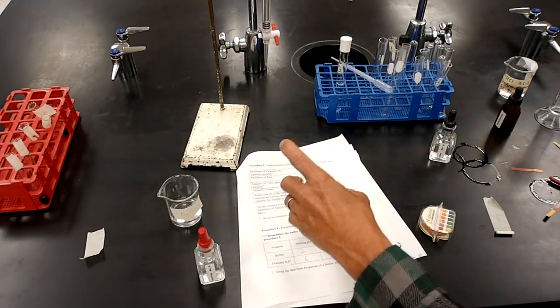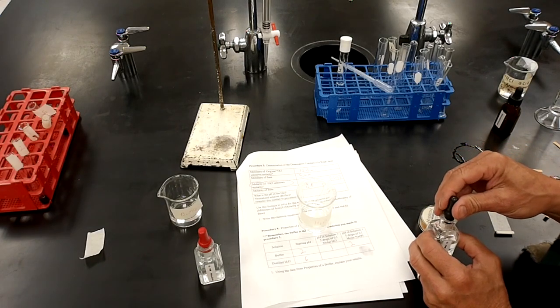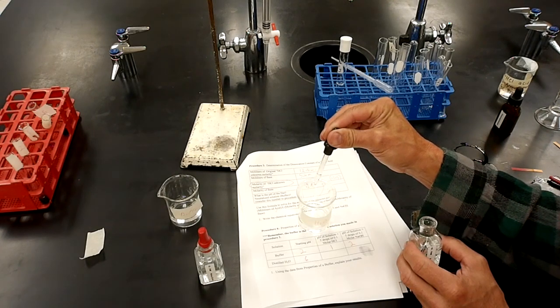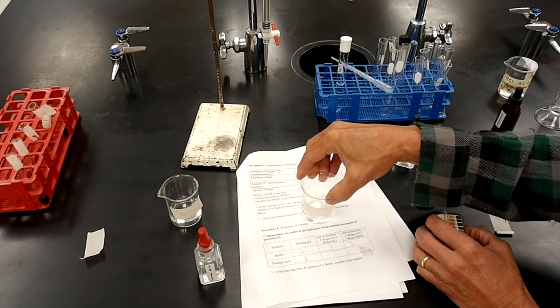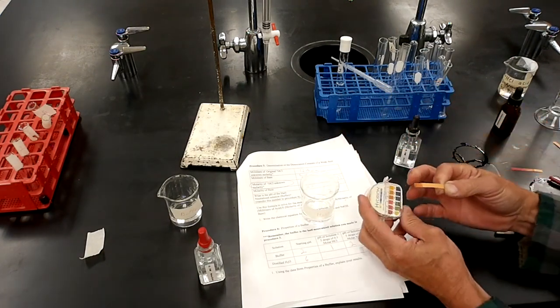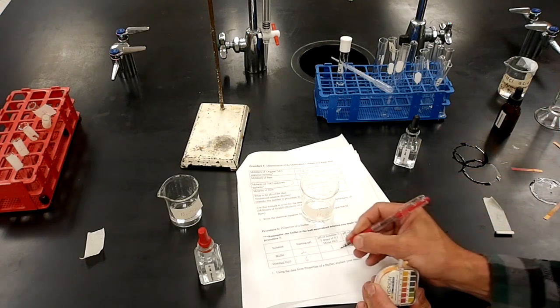Now we've got the distilled water. This has nothing in it but water. We measured its pH. The pH was about 6. Now I'll add 1, 2, 3, 4, 5 drops of hydrochloric acid. Measure the pH. And it's looking like a pH of 4.